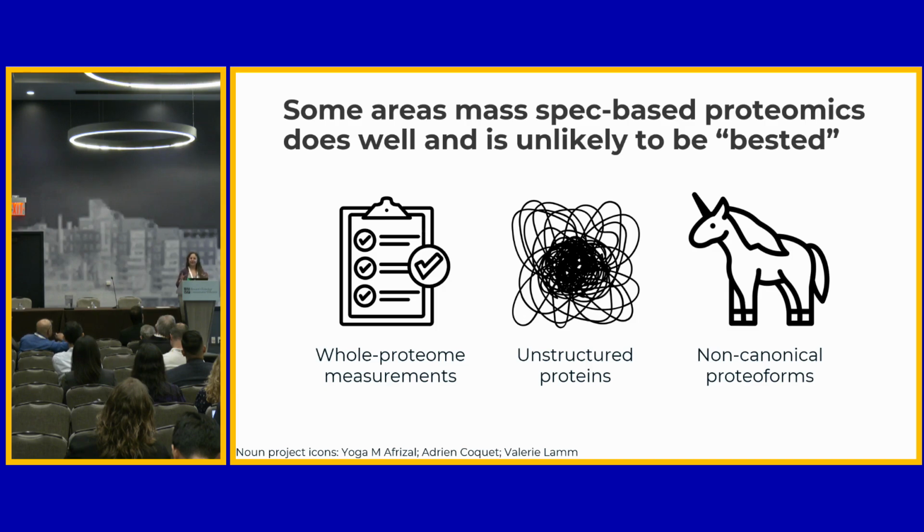Our difficulty, our blessing and our curse, is that there is so much informatic work you could do to either program your mass spectrometer, or prep your samples a different way, or report the data, analyze it a different way. That is great for these kinds of ill-defined problems here, but obviously becomes a bit of a downfall when you just need to do one simple thing and do it a lot of times.